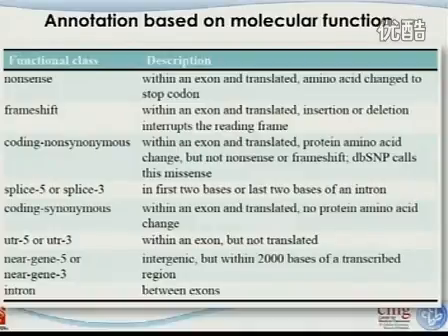A lot of people consider this type not very important, but new developments found that a lot of synonymous variations are actually quite important as well. The next category is the variations occurring in the 3' or 5' untranslated regions. These regions are within the exon but not translated. Tatiana commented that in most exon sequencing, the capture part does not include the 5' UTR and the 3' UTR.